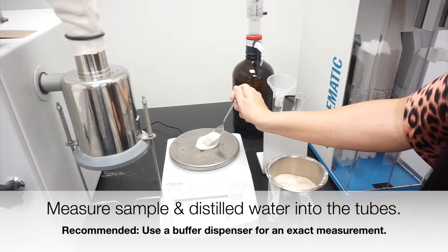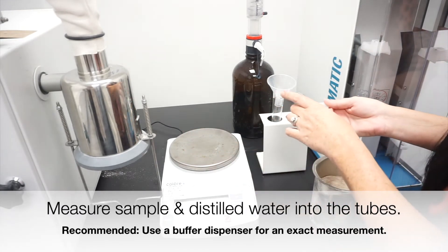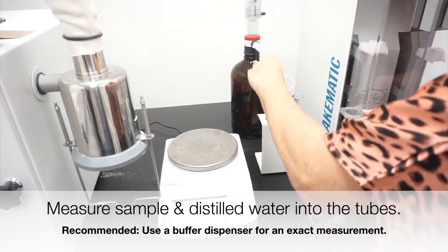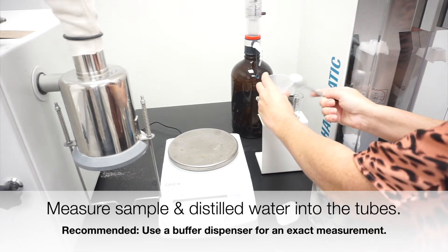As per the falling number standard method, 300g of sample is ground in an approved mill. In this case, we are using the Perton 3100 mill. Once the sample is ground and the mill has self-cleaned, a carefully weighed out sample is put into the falling number viscometer tube with the correct amount of water.